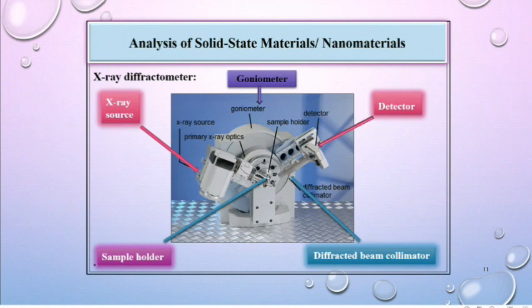Since every element or compound has a set of unique d-spacings, by converting the diffraction peaks to d-spacings and comparing them with a standard reference pattern, the specimen can be identified. When a mixture of different phases is present in the specimen, the resultant diffractogram would be formed by addition of the individual patterns. Each crystalline solid produces line spectra. Both the position and the intensity of the line are characteristics of that particular phase and the pattern, and thus provide a fingerprint of the material.